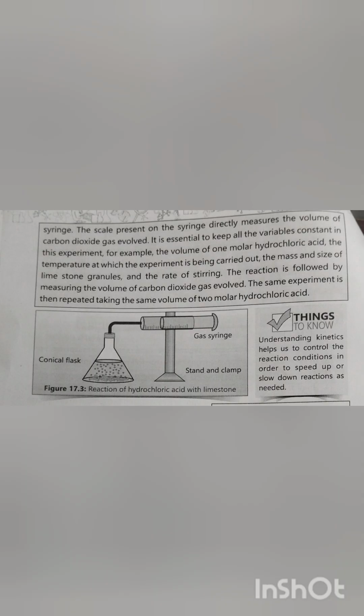The reactants required in this experiment: first, limestone granules added to the flask in excess, ensuring there is more than enough to fully react with all the acid. The second is hydrochloric acid. A fixed, identical volume is used for each experimental trial.